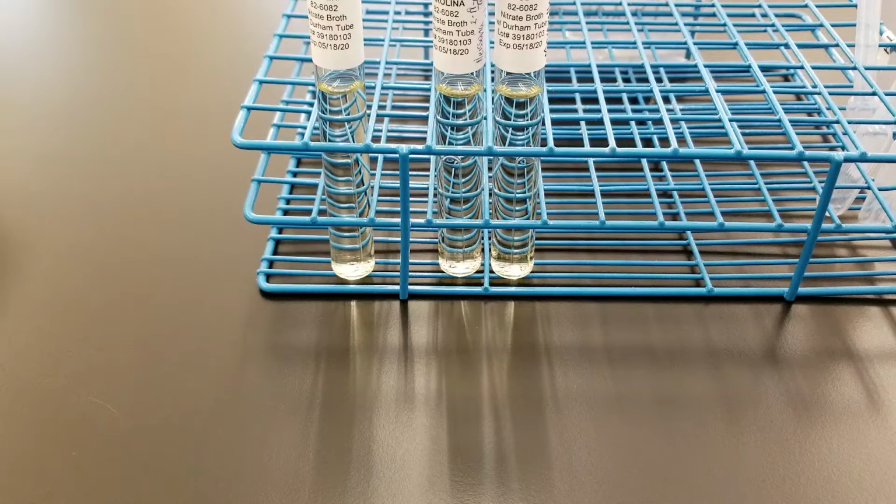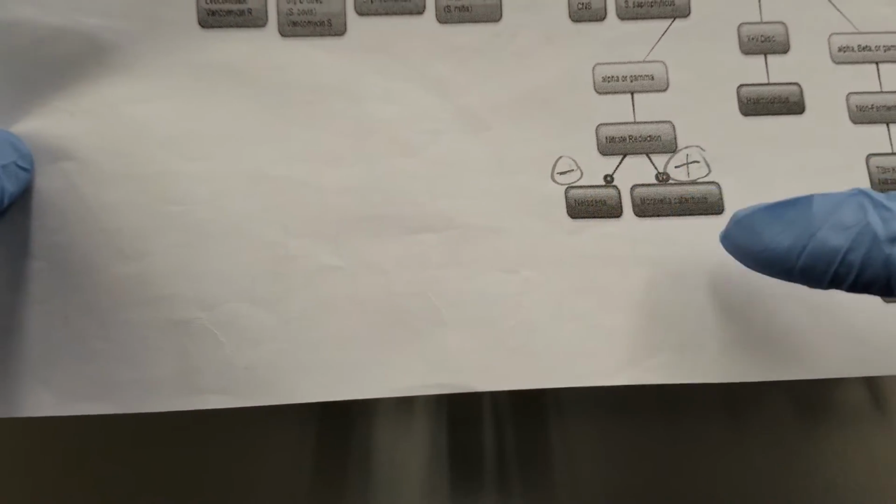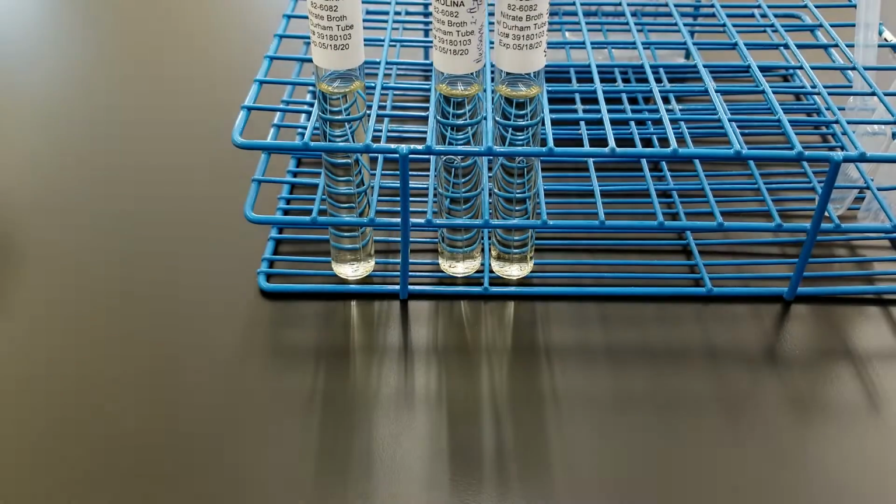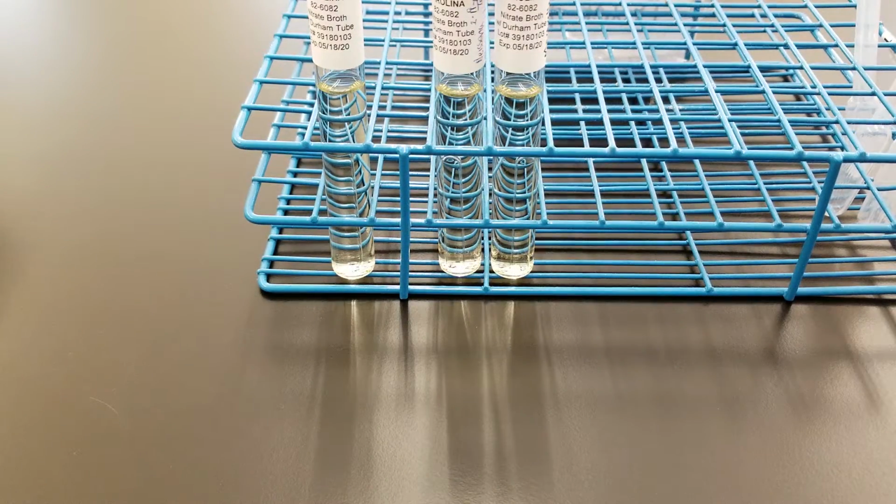So if you look at your decision tree that we went over in another video, there was accidentally a typo down here of Moraxella and Neisseria. Neisseria should be nitrate reduction negative, and Moraxella catarrhalis should be nitrate reduction positive. I accidentally made a mistake when I did that the first time.